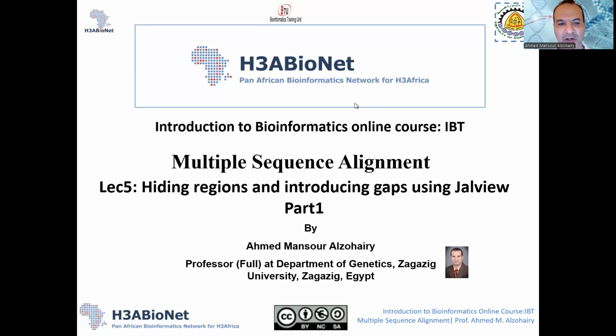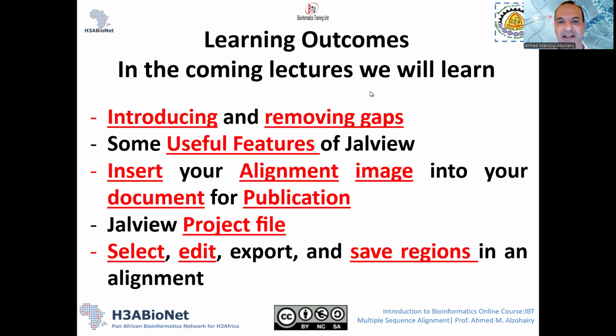We'll talk now about how to hide regions and introduce some gaps using Jalview. And this is one of the most important and advanced techniques that can be used by users to make a good presentation for your work in a professional way. So actually, you can introduce and remove gaps. We'll learn this in this lecture.